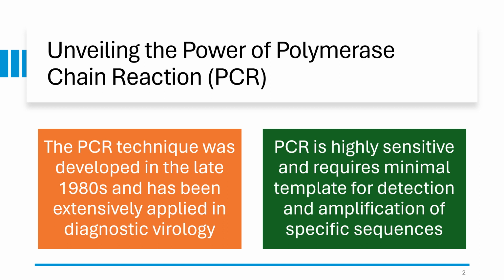Unveiling the power of polymerase chain reaction (PCR). The PCR technique was developed in the late 1980s by Kary Mullis and has been extensively applied in diagnostic virology. PCR is a highly sensitive technique and requires minimal template for detection and amplification of specific sequences.